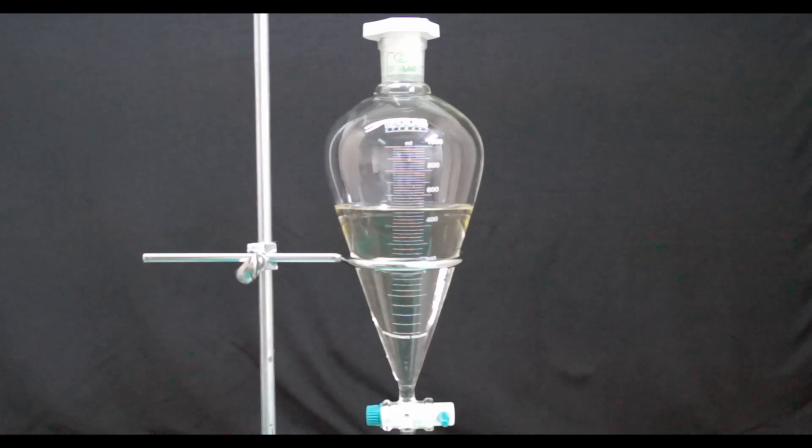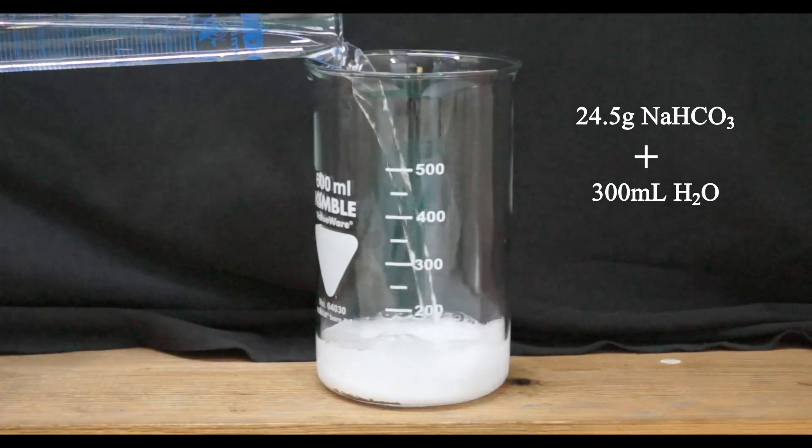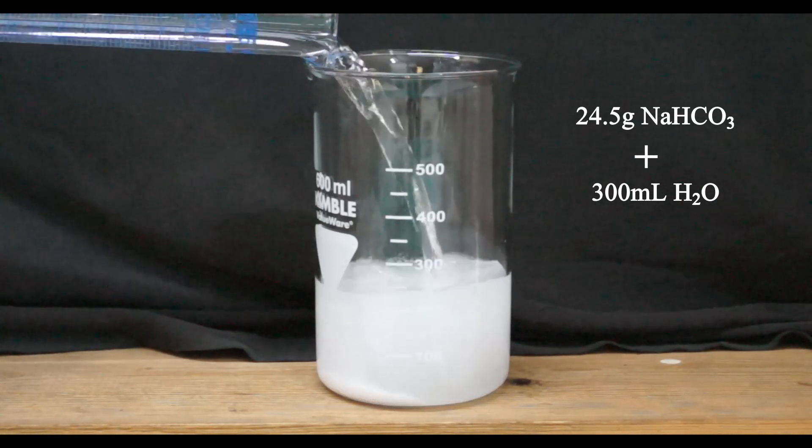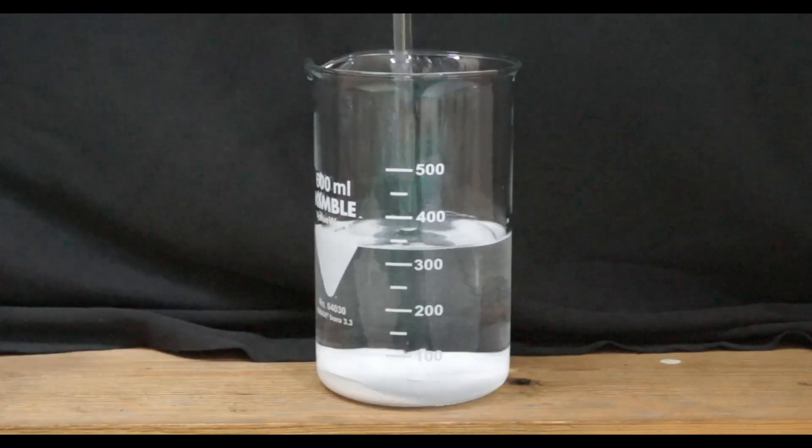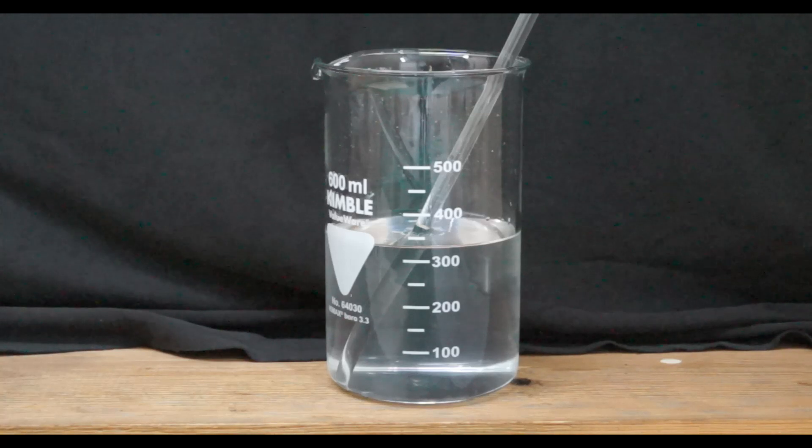After charging the crude products to the one liter separatory funnel I prepared the solution of 24.5 grams of sodium bicarbonate in 300 milliliters of water. After some stirring I obtained a clear solution of sodium bicarbonate.